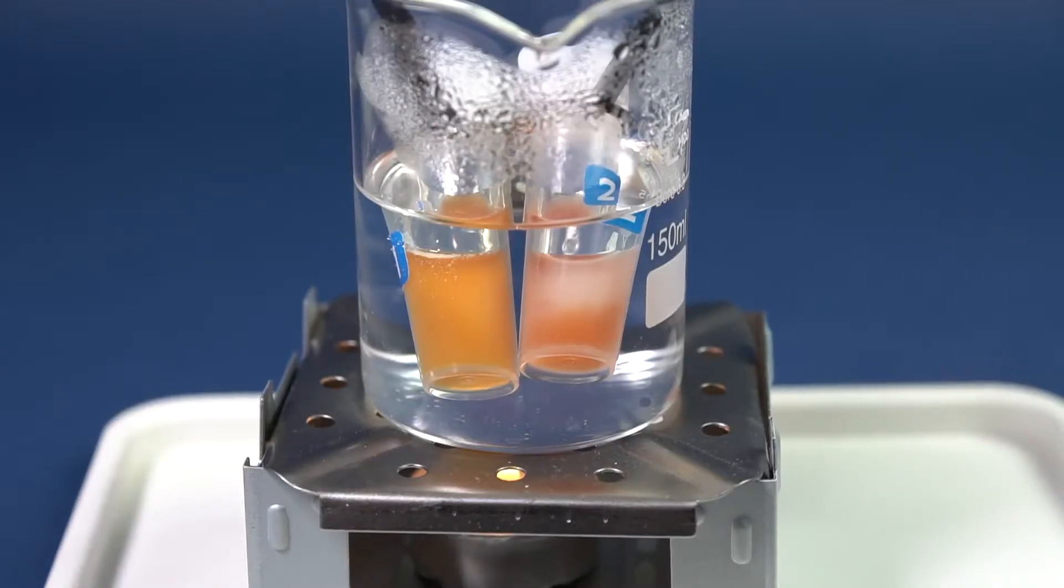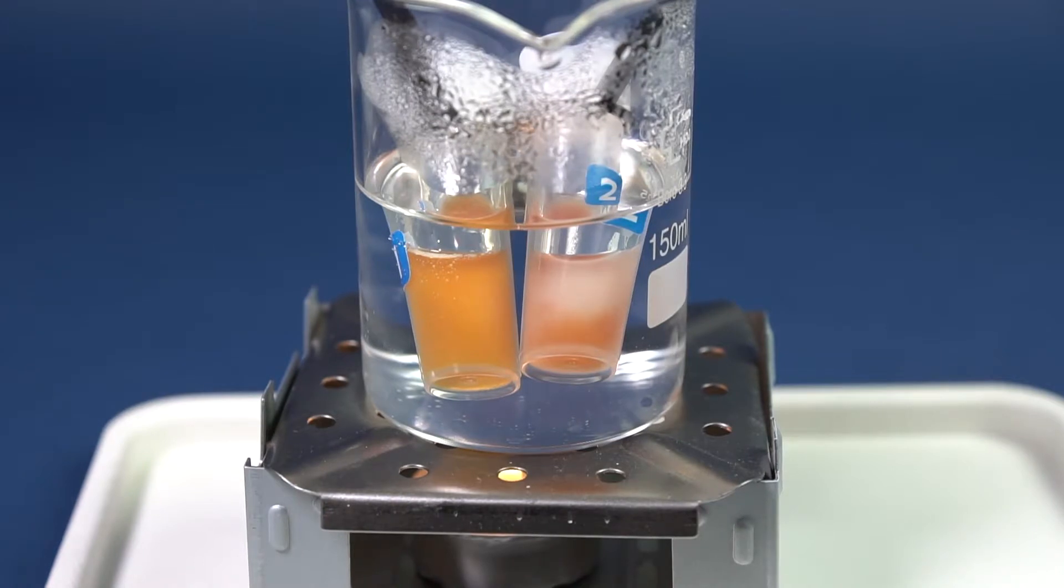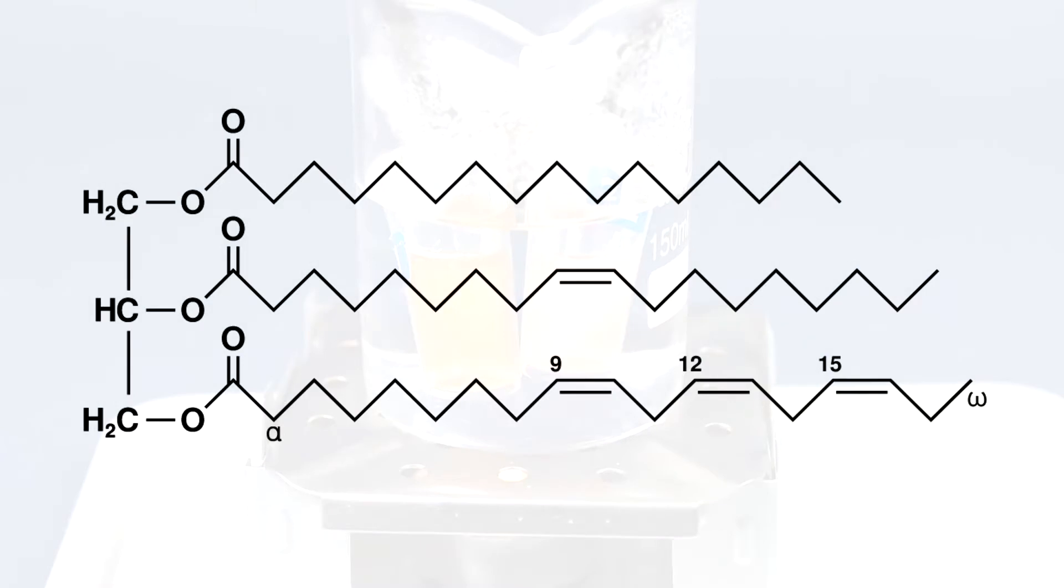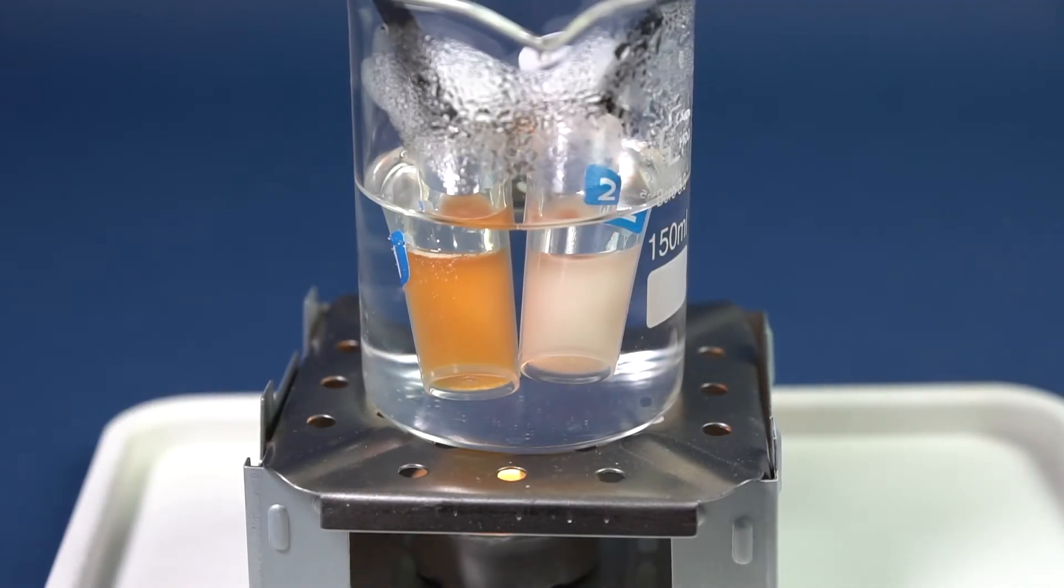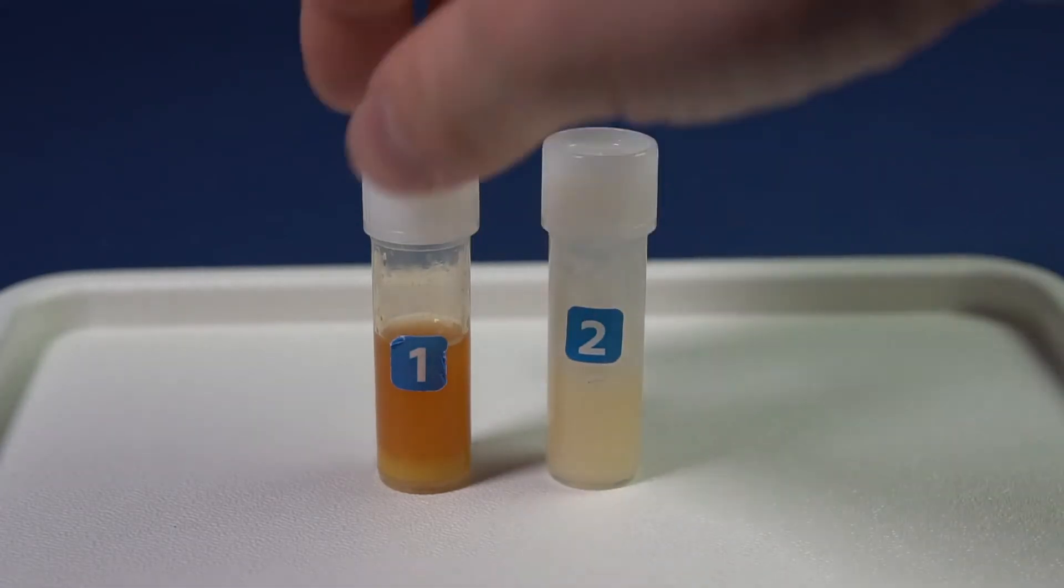Now observe the color change. In the vial of vegetable oil, the brown coloring of iodine disappears. In the molecules of vegetable oil, there are unsaturated double carbon bonds which can react with iodine molecules. This is how halogen derivatives of fat acids are formed, which makes the mixture become colorless.